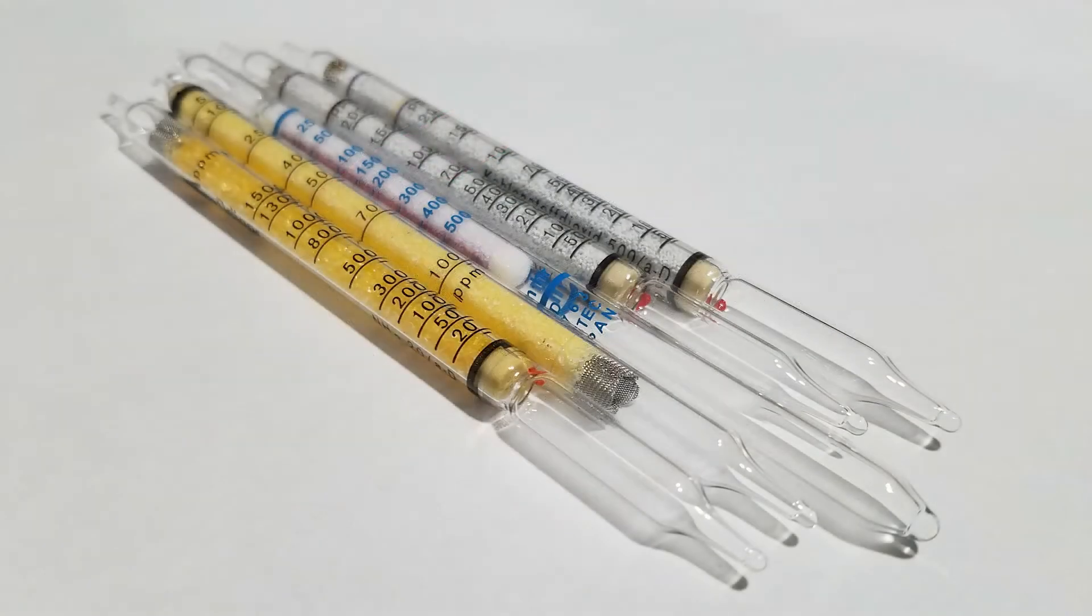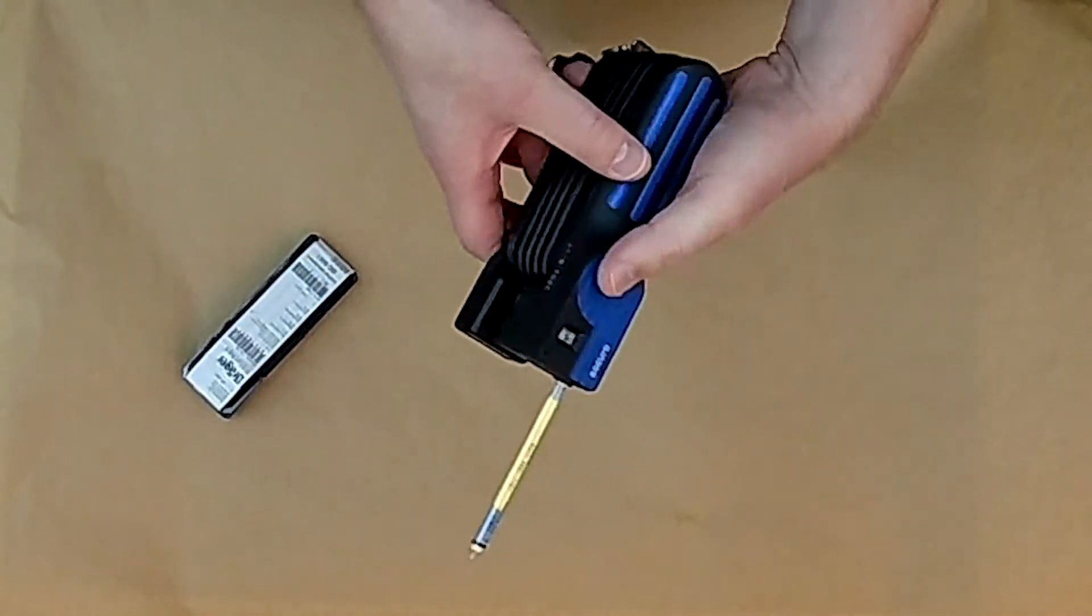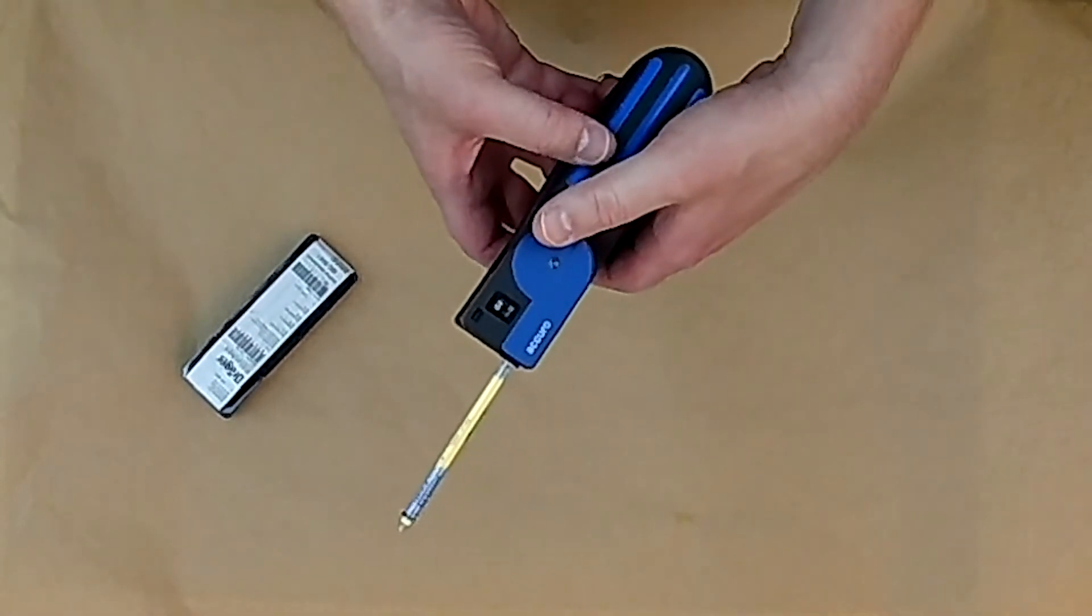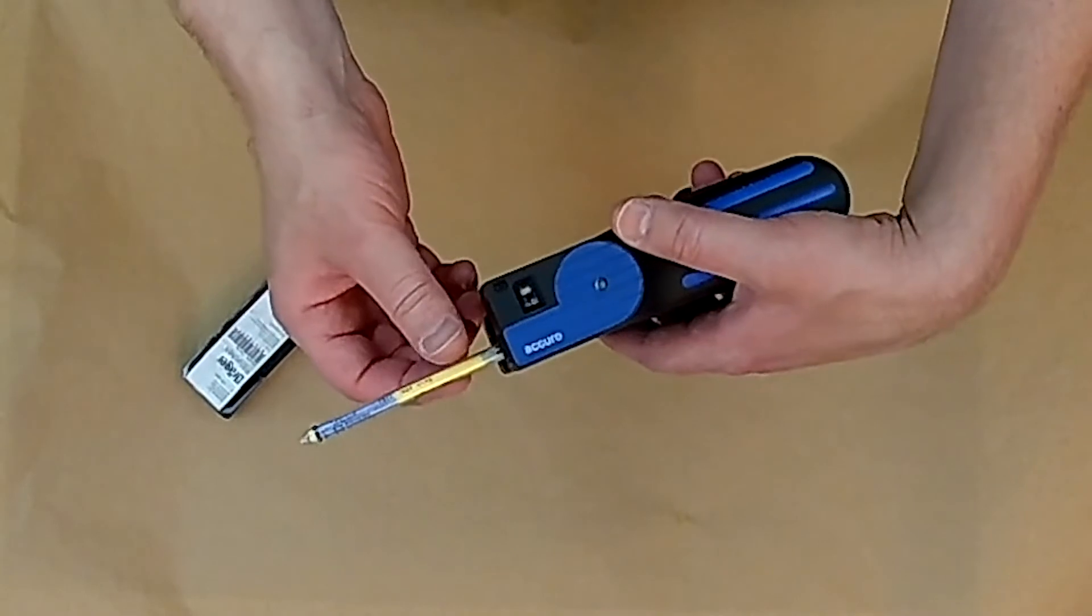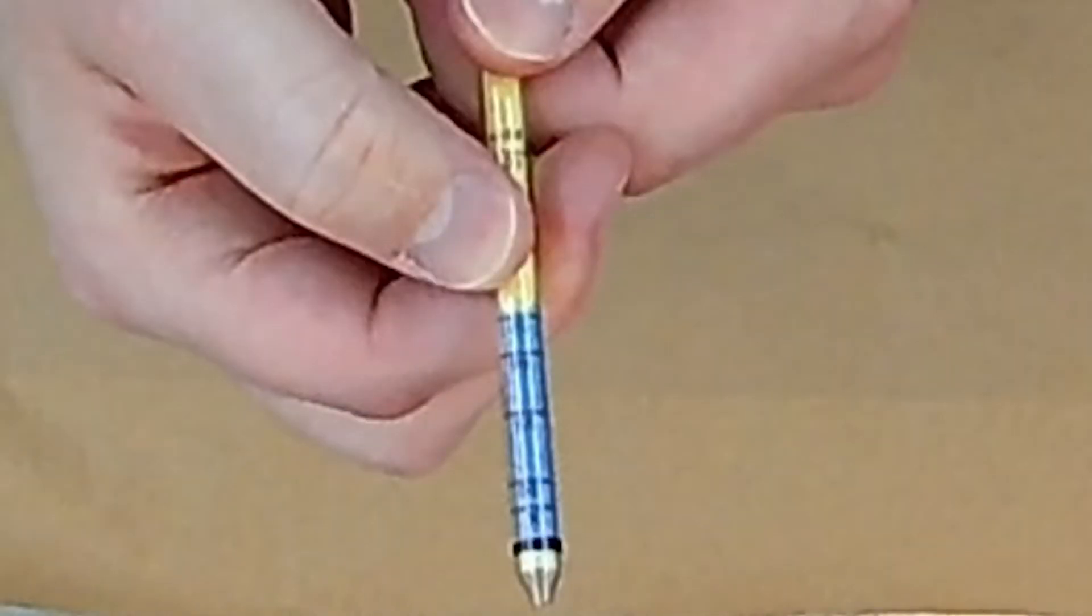These are colorimetric tubes. The pen-sized glass tubes change color along their length after exposure to ammonia as the contents of the tube react with the gas in the air. The length of the color change on the detector tube indicates the concentration of ammonia, just like a glass thermometer indicates temperature.